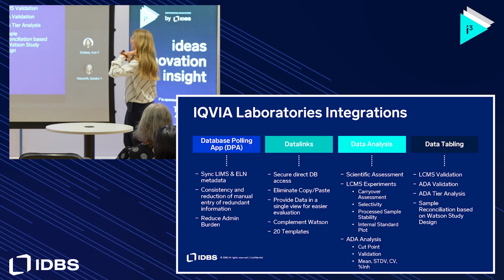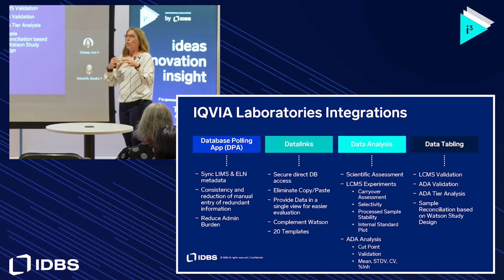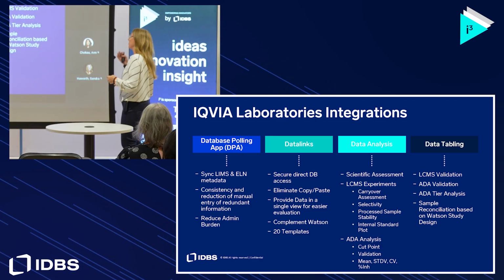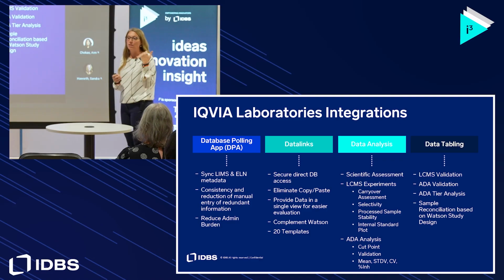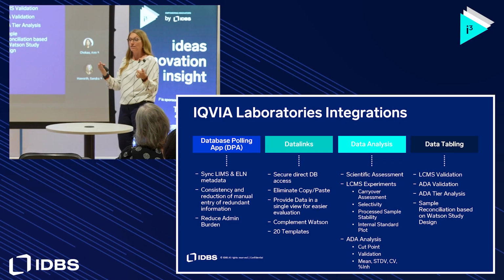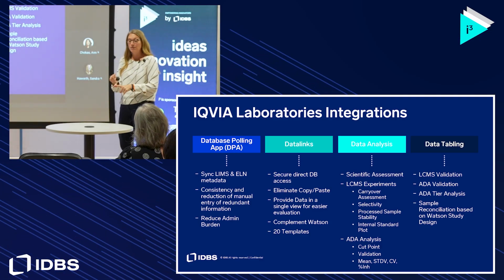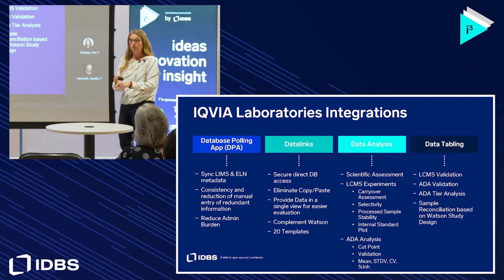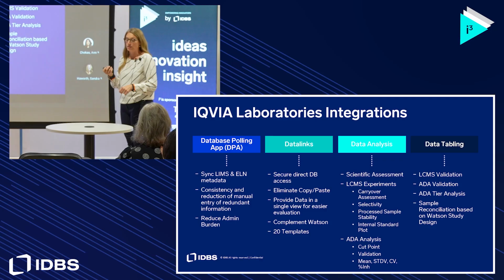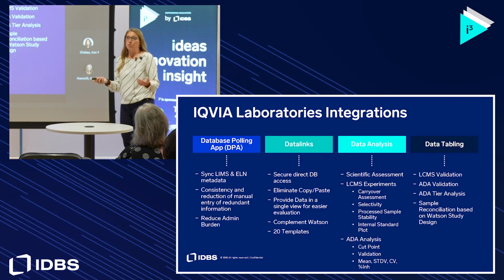I don't know if you have a LIMS system that you use or if you use Watson LIMS, but do you ever try to track reassays? Because that's not fun. So this is essentially what we've built. We can query all of the samples that have been received in Watson, and compare that against the samples that have a result, and tell the project manager what samples still need to be analyzed and don't have a result. This has been very helpful because that's one of the most manual processes that I think Watson doesn't necessarily handle well, or at least how I've used Watson.